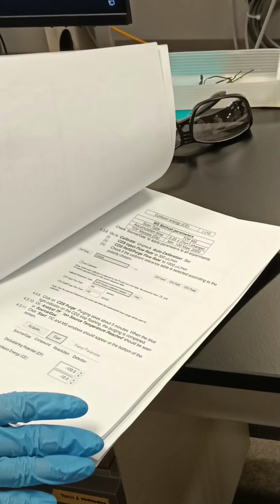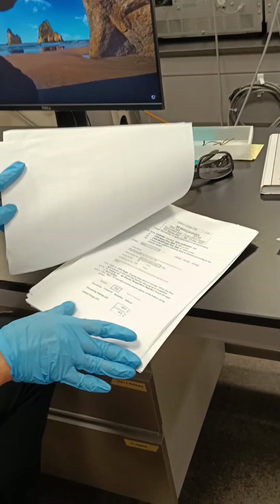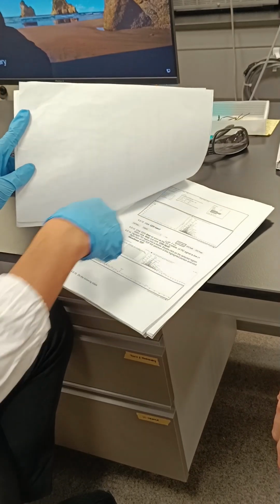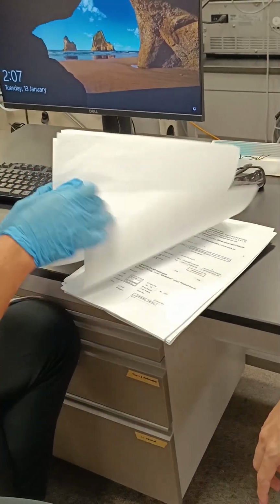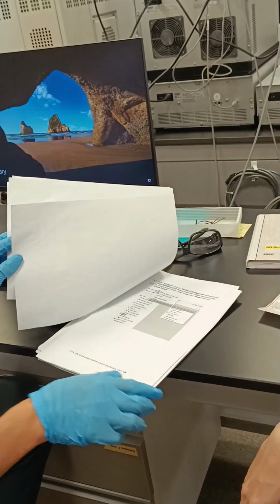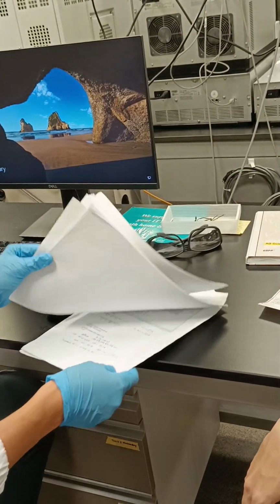And then calibration, all this stuff. This is the parameter setting. Let me just quickly go through first. Then we have to do all this calibration to make sure that everything is fine before we can really run through our own batch of samples. Then you just load your samples. But it's a bit complicated here, so I'll have to guide you guys.